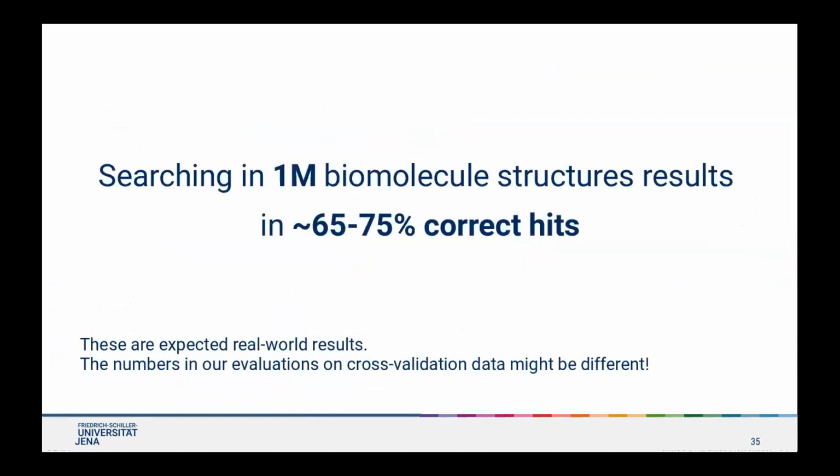As a default, we usually provide a merged biological structure database that can be used. Searching in this database, we evaluated a real world performance of 65 to 75 percent correct annotations.